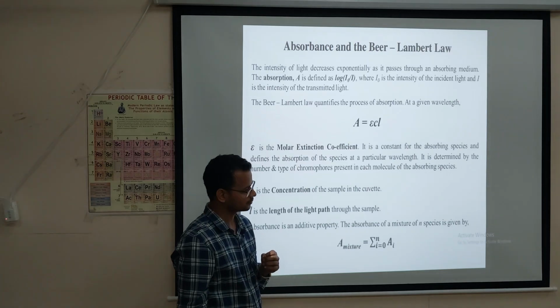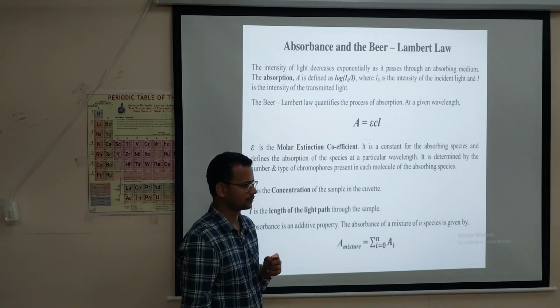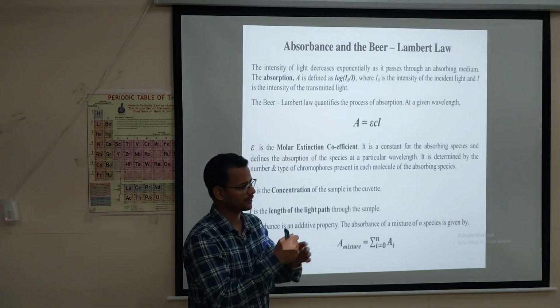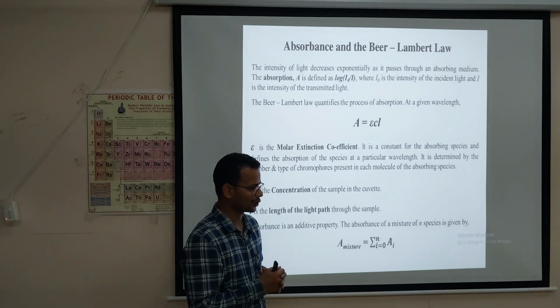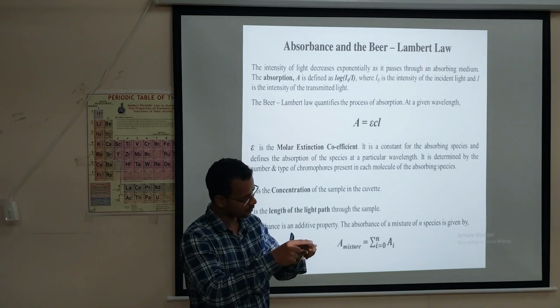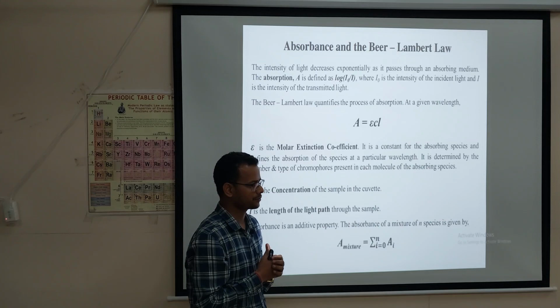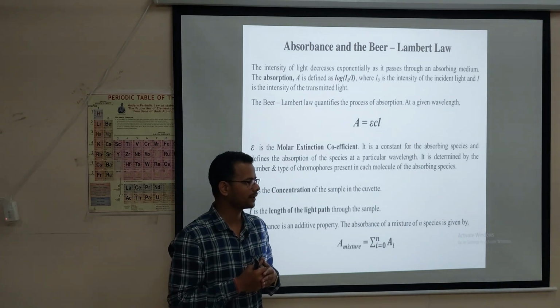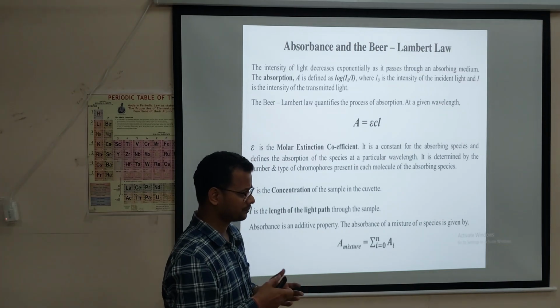Right, scatter, right. Out of plane, that is right. Because the internal reflection will occur there, na? That will inhibit the internal reflections. The light will pass only in one direction. That helps for that purpose. Clear? Or any other doubt? Okay.